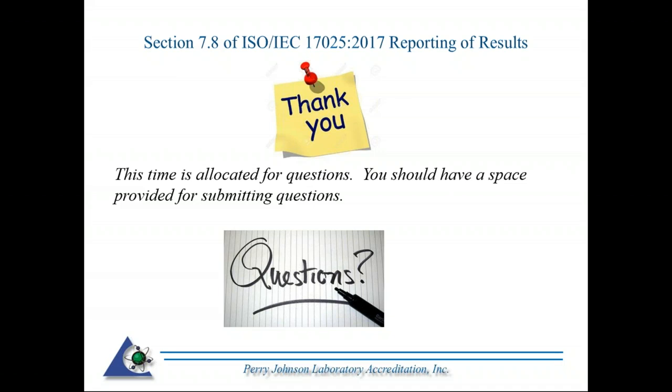With the calibration interval, you have a NIST traceable thermometer. Is it something that, as far as when the equipment needs to be calibrated or when it needs to be traceable? If it needs to be a traceable measurement, then it needs to be calibrated. And is it a component of your uncertainty? If so, then of course it needs to be calibrated. As far as the interval, typically I would recommend at least a year to start off with, depending on how much of an impact it would have on your testing or calibration if it did happen to drift out of calibration.